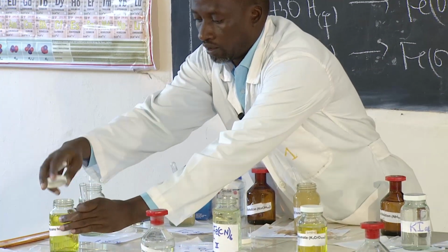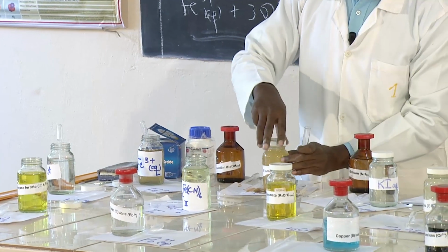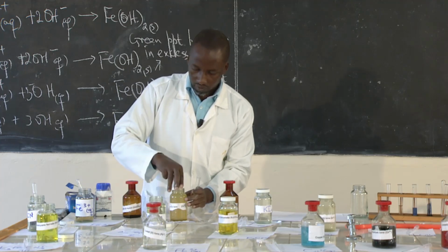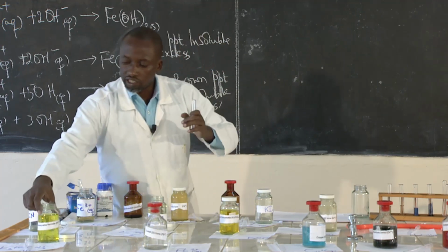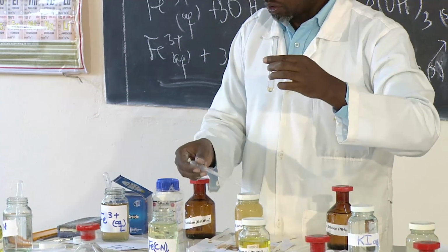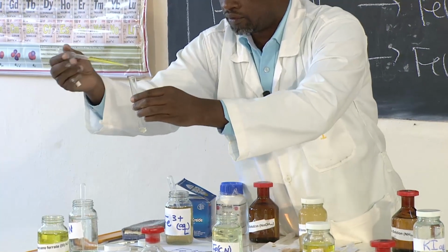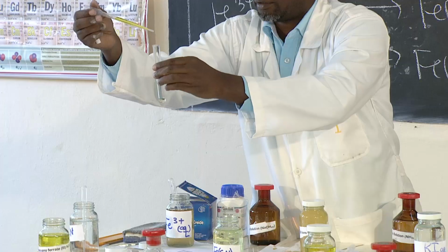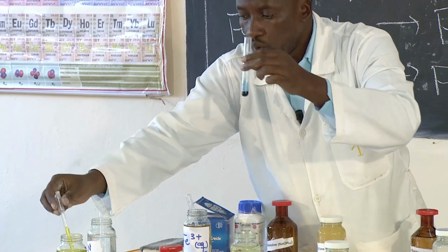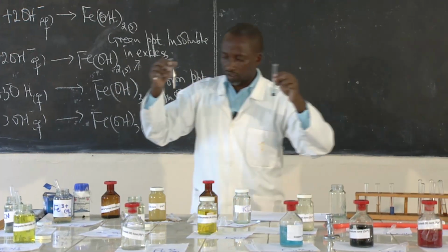Now we'll add potassium hexacyanoferrate 3 to iron 2. Hexacyanoferrate 3, iron 2 with 3. You see what is happening?